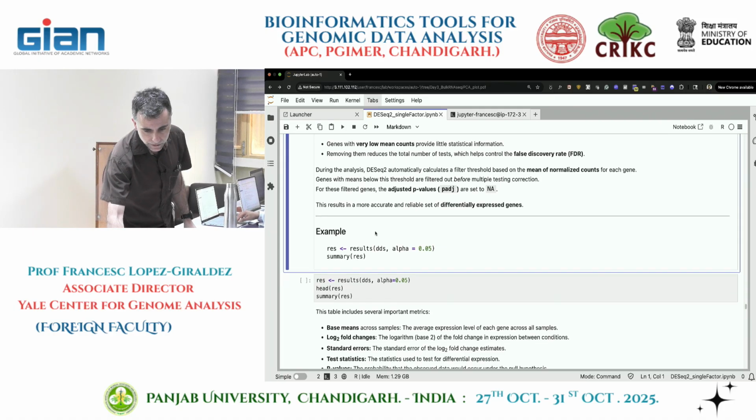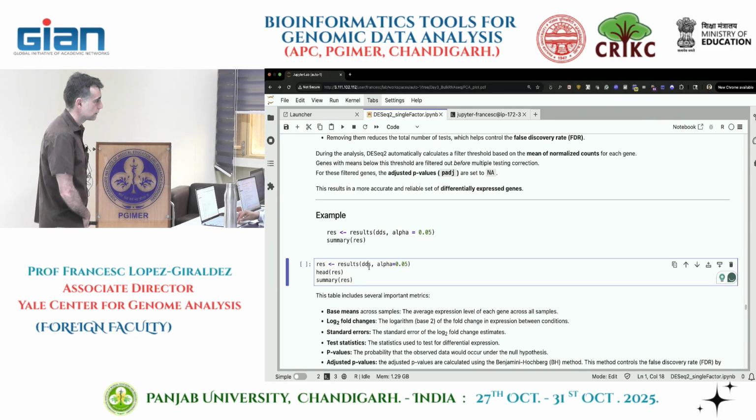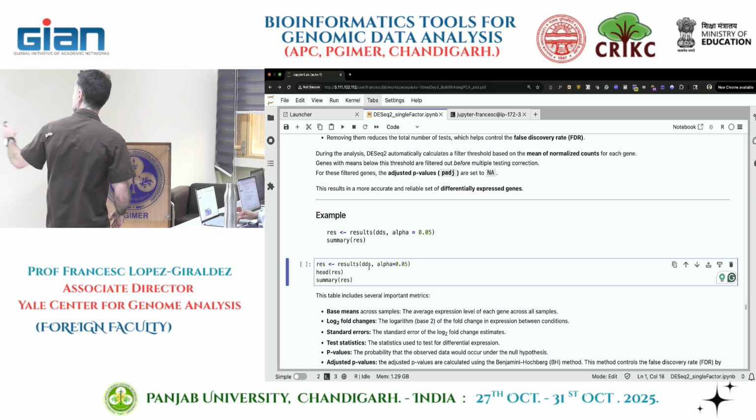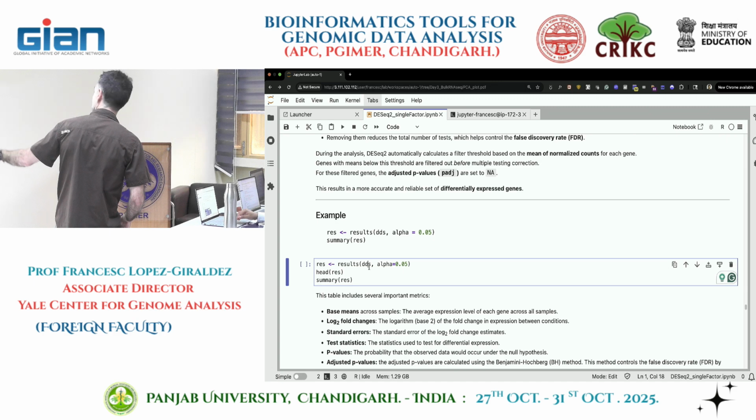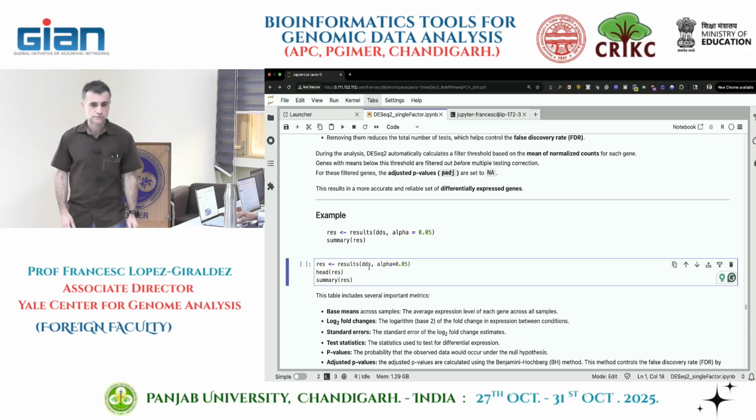Sometimes it comes up true and false in the data, or the false discovery rate is less than 0.01. So if you want to be more stringent about your false discovery rate, your alpha, you can reduce it when you do this. You can change it here, to 0.01 for example, if you want to. Otherwise 0.05 is sufficient. I'm assuming the default is 0.05, but there's nothing bad about being explicit about what you do, right?